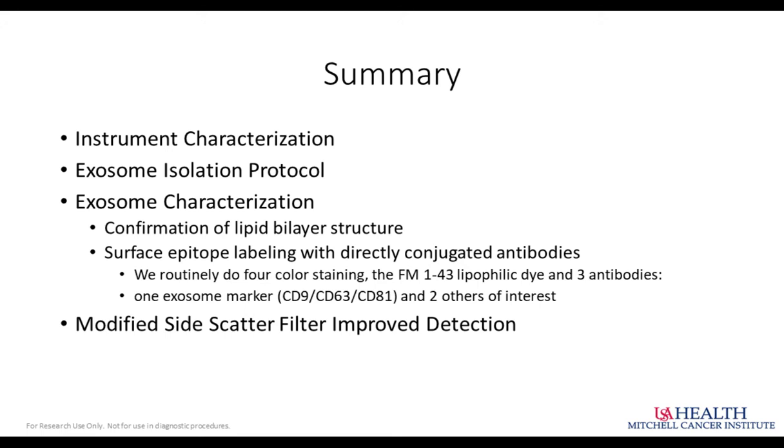There have been groups that have done just phenomenal live cell imaging. You can actually pre-label the membrane with some of these dyes. I talked about the lipophilic dyes, and then literally over time-lapse videography, watch exosomes being released from cells in real time. It's a phenomenal thing. So we know how it works. We can watch it. And really, you just think about small, medium, and large. That's the best way to think of it.